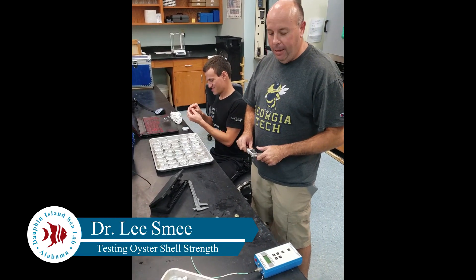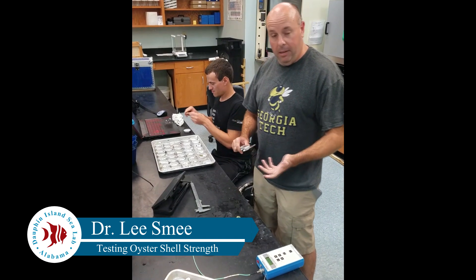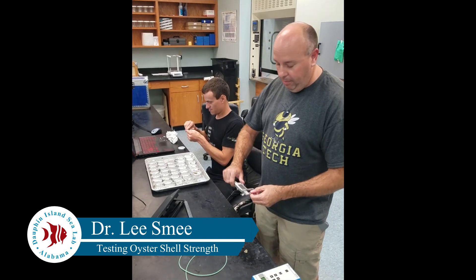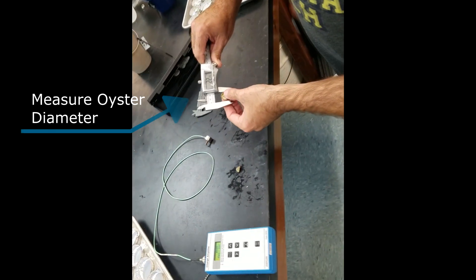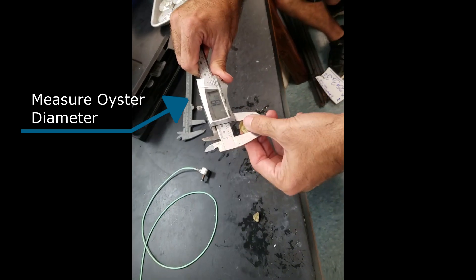Alright, so today we're looking at morphological changes of oysters after they've been exposed or not exposed to blue crab predators. These are oysters that have not had previous blue crab exposure. The first thing we're doing is measuring the diameter of the oyster using a set of digital calipers.